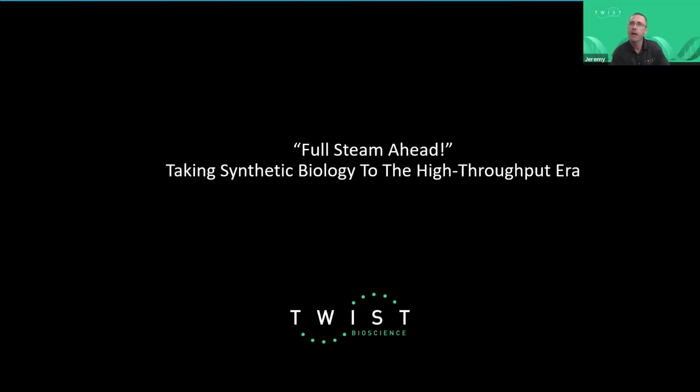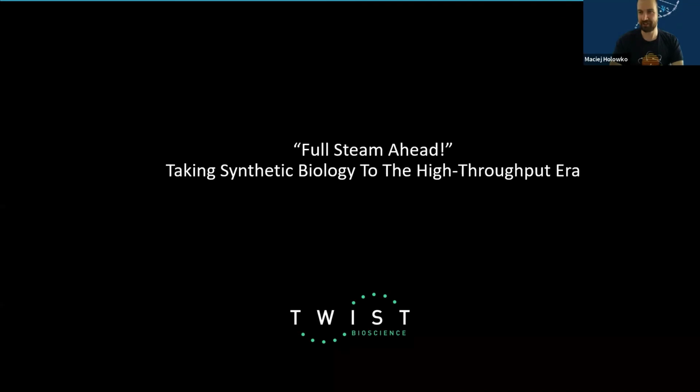All right, Janet. Which step in the cloning workflow benefits the most from automation, in your opinion? Well, I guess all of them really, because it's pretty much the same process, but multiplied, right? You just take your normal reaction: you have to prepare your DNA, clean it up, put it together with cells, transform, incubate and everything. So really, it's a parallel process. It doesn't speed it up because you have to run your assembly reaction and do your outgrowth after transformation, so you cannot cut down this time. But because you're not doing 5 transformations, you're doing 100 or 200, that's where the advantage is.